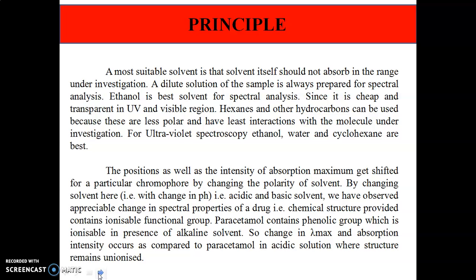Ethanol is the best solvent for spectral analysis since it is transparent in the UV and visible region. Hexanes and other hydrocarbons can be used because these are less polar and have least interactions with the molecule under investigation. For ultraviolet spectroscopy, ethanol, water and cyclohexane are the best solvents.